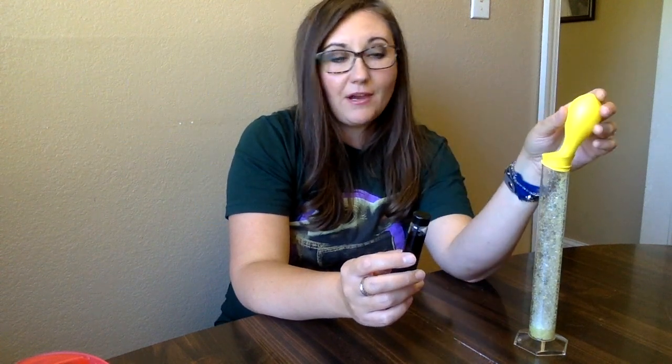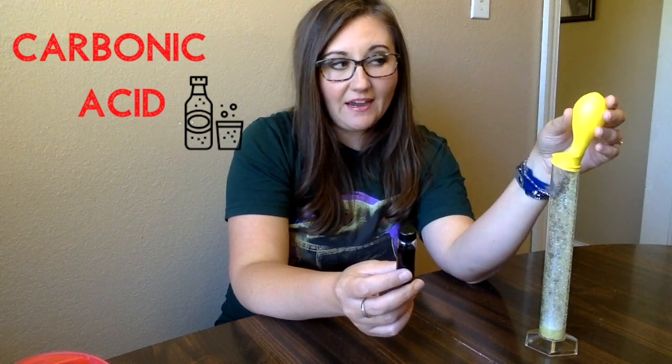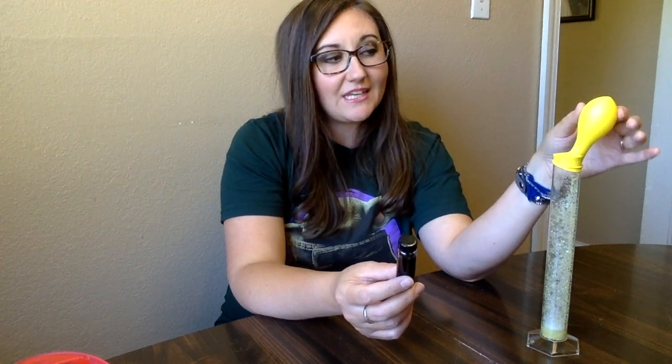Now, here's the cool thing about carbon dioxide gas: when it dissolves in water, it creates something called carbonic acid. So technically, if this gas dissolved in water, then it's going to make a weak acid, okay? Which is kind of interesting because the soda that you drink has dissolved carbon dioxide and water in it, so it's slightly acidic. It's got that carbonic acid in it. So what I'm going to do is I'm going to take this balloon off. I'm going to put it over this bromothymol blue, which by the way is mixed with water in this little tube, and I'm just going to leave it there for a while, and then we're going to come back to it and see what happens.